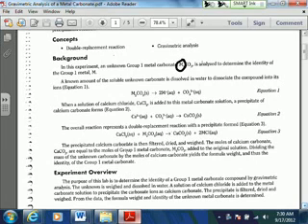We know it's in group 1. We don't know what it is, okay? And that's actually better than people will know a lot of times when they're really doing this. They probably wouldn't know what group it's in necessarily until they do some experimentation and figure out what the ratio is there. But they're telling us this is M2CO3, so it's got to be something in group 1.